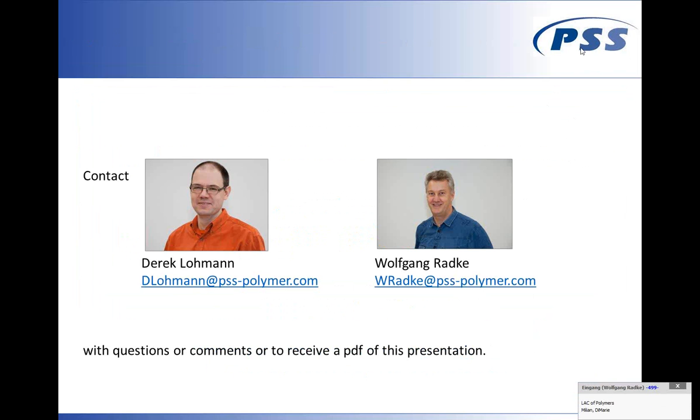So if I run a gradient and know the dwell volume of my instrument and my column volume, I can calculate that at 5 milliliters in retention volume, I have a composition of THF and chloroform of 60%. That is always a good starting point to then establish the critical composition. So then you really have to go into this trial and error procedure.